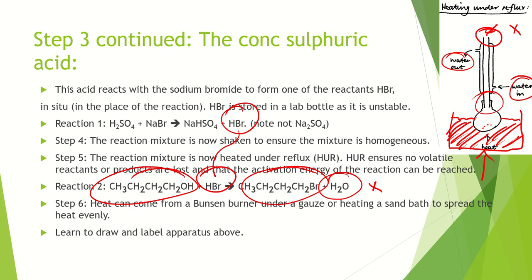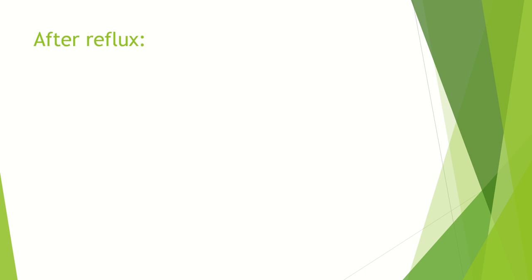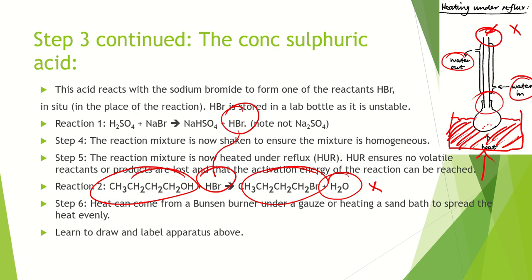So this is just a picture of a sand bath, just to show you how you get that nice, even heating. And sand produces a really nice even heating around that. Right, so we've carried out our heat under reflux, as I said, up here on the top right-hand corner. Now what are we going to do?